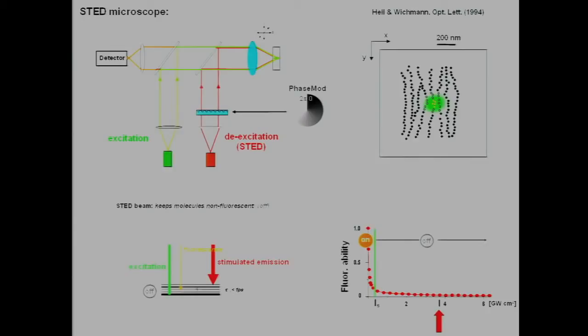Now, how do we get the rest of the images? Well, it's very simple. We have to see them and shut them off sequentially, as it is shown in here. If we go from one to the next, like this, now we can separate these two from those three, and so on. We proceed like that, and in the end, of course, we can separate the strands, and now we should get a much, much higher spatial resolution, at least on paper, of course.